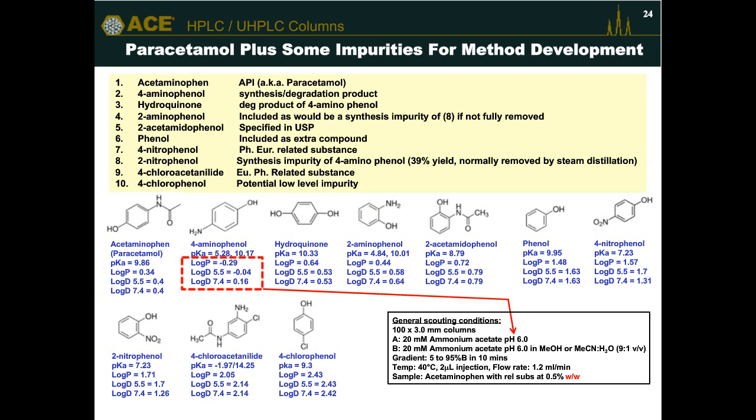So we weigh out the individual compounds, we dissolve them, we make them up, we filter the sample, we put it on the instrument, and we press go, and we walk away. Now, our instrument is set up as a screening system, so all the methods are already written, the sequence executes, and we get 2 sheets of paper that come out on the printer next to the instrument.